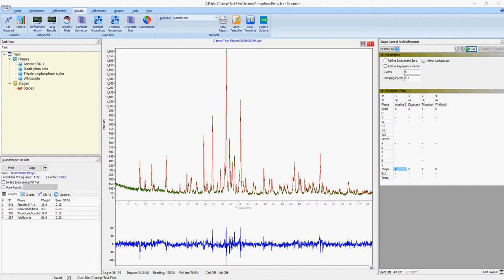Once the standard has been run and refined, we can then run and refine our main sample. Now for this tutorial, I'm not going to go through the refinement process and we'll use scans that have already been done.